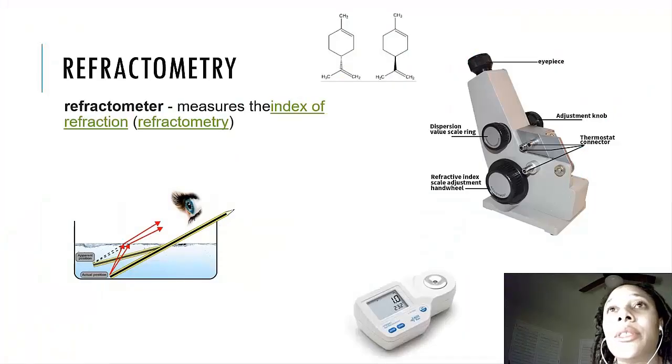And there's a little bit about the theory of that. But refractive index is basically a concept related to physics, where depending on the media that you're using, whether it's a solid or liquid, materials actually move light differently.